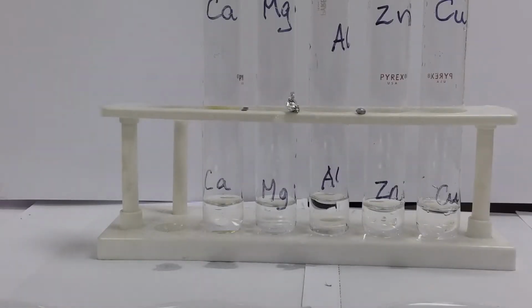So what we have are some test tubes, boiling tubes rather, that have some distilled water and 2 drops of phenolphthalein. And the phenolphthalein is to determine, of course, you should be familiar with, whether there is any change in the pH of the contents of the test tube.